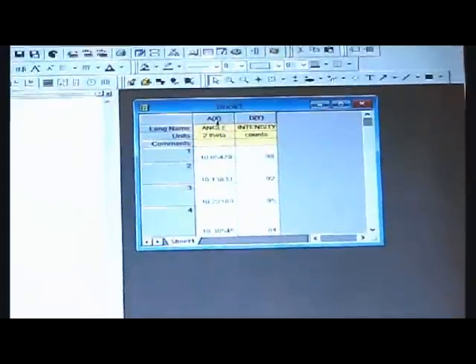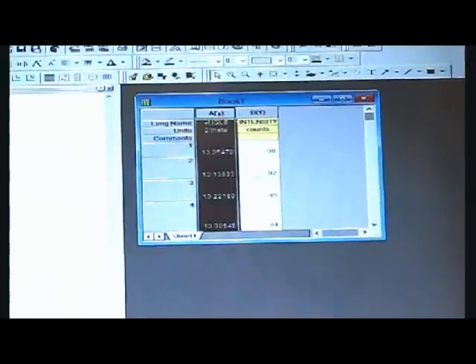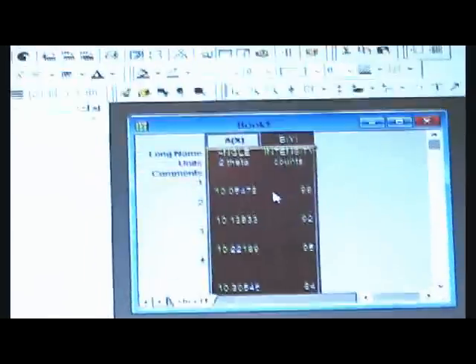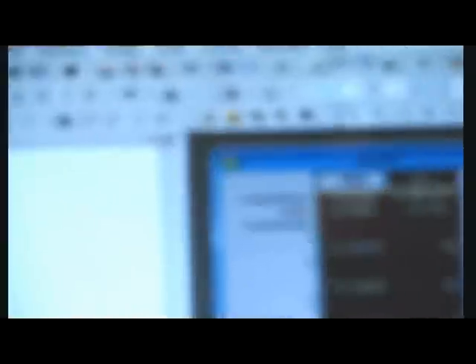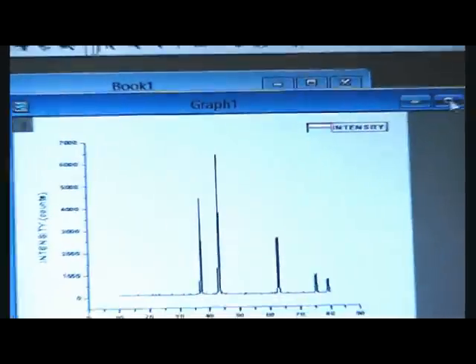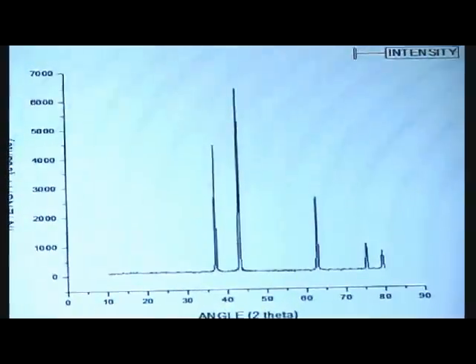Now we can plot it. So select the A(X) and B(Y) columns. Then go to the graph icon and click on it. Now we get the plot of given XRD data.